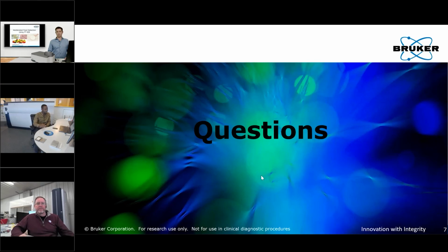Right. Thank you, Chris. So we have one for Chris Clark. It says, the FTNIR would analyze powder and dissolved samples. I guess they're asking if you can do both powdery samples and solubilized samples with FTNIR.